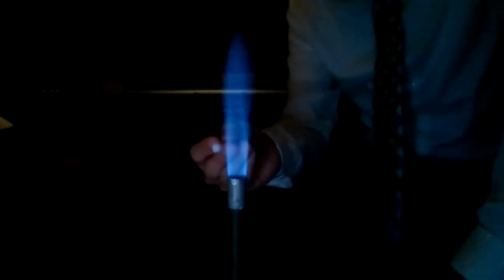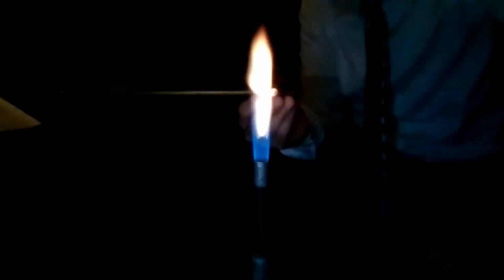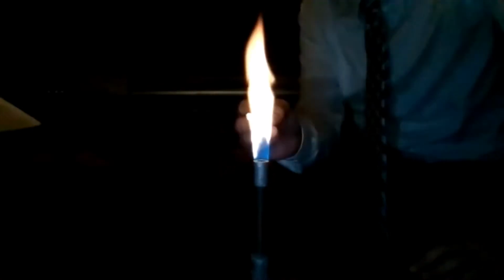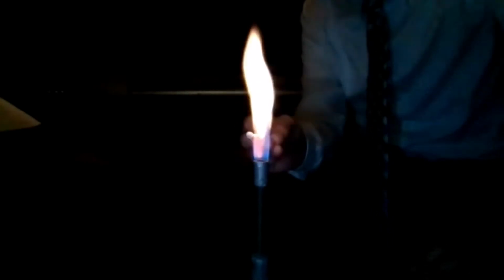Someone pick one. Barium? Okay. Oh, that's a lot of barium on there. Whoa. Can you guys see that color, or is it too bright? It's too bright. It just looks like normal fire. It looks like orange.